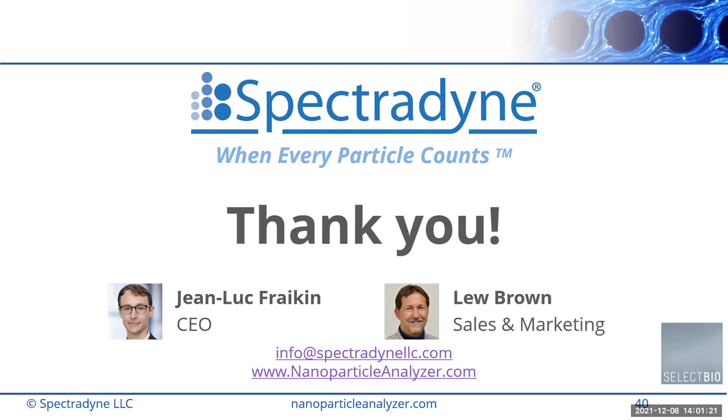What mitigation strategies do you propose for the issue that you cannot measure below 50 nanometers? Because sometimes you could produce lipid nanoparticles that are around that range, and maybe some subpopulation might be lost in the count.